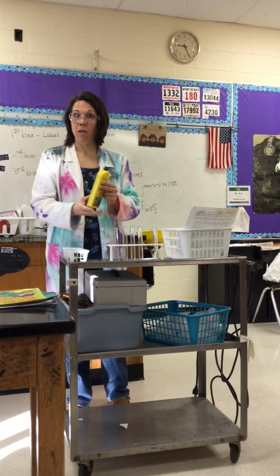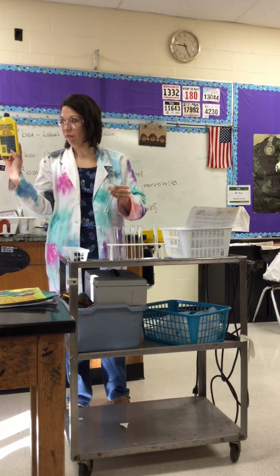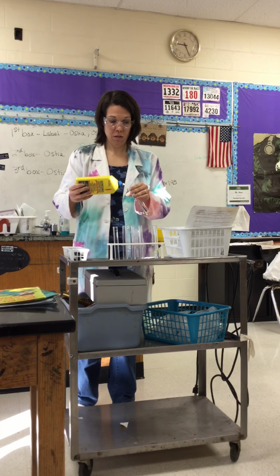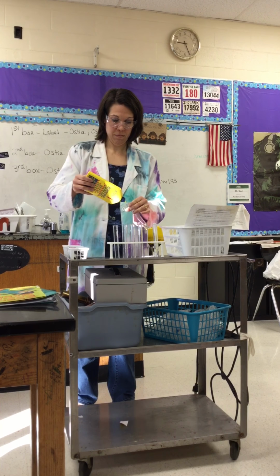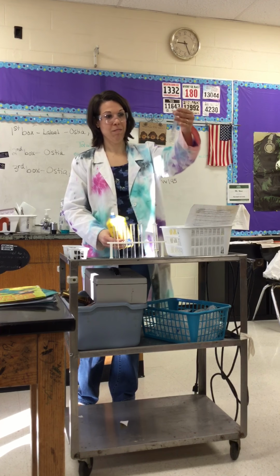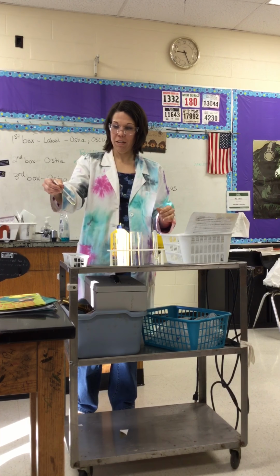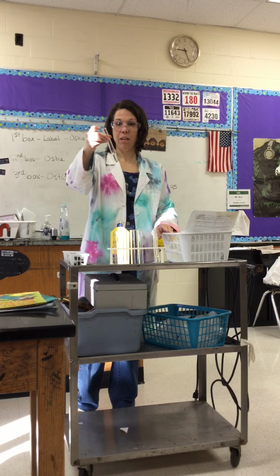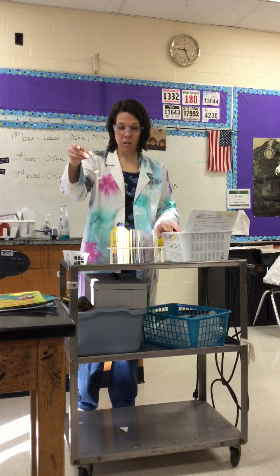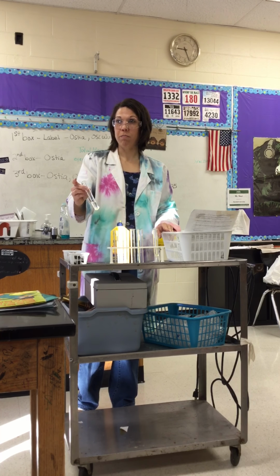Okay, so the rule of solubility, like dissolves like: lighter fluid's nonpolar. So it mixes. Look at that, guys. So it's a positive test. Lighter fluid and the oil mix. It turns a yellow tinge because of the oil, but it dissolves the oil.